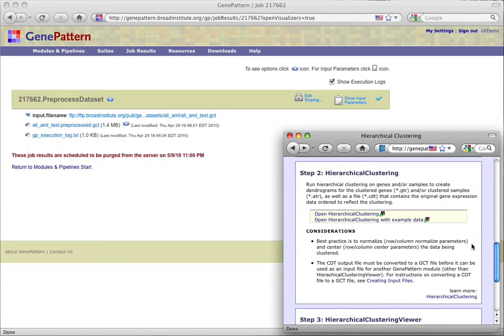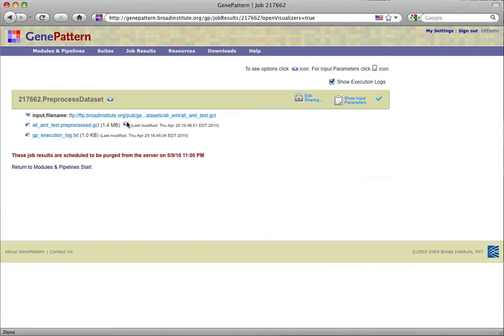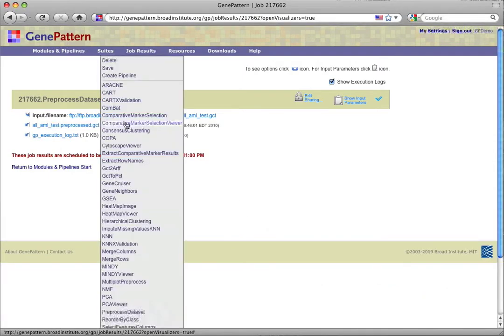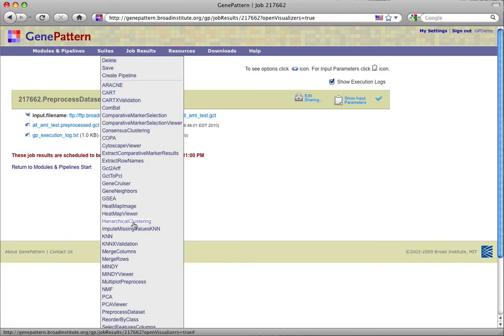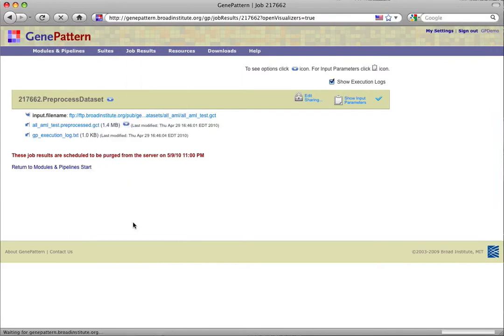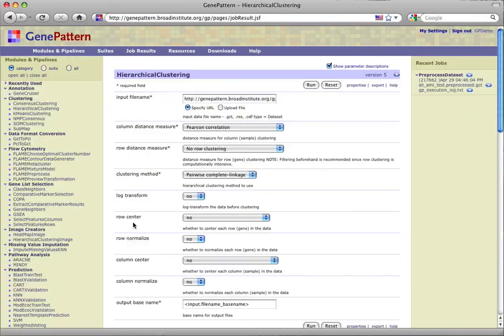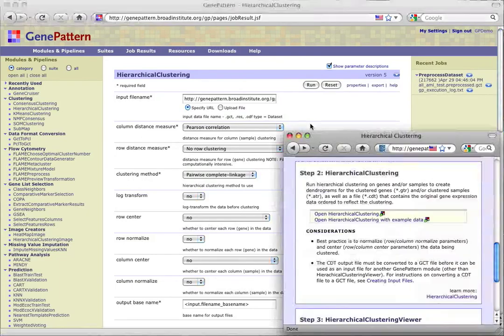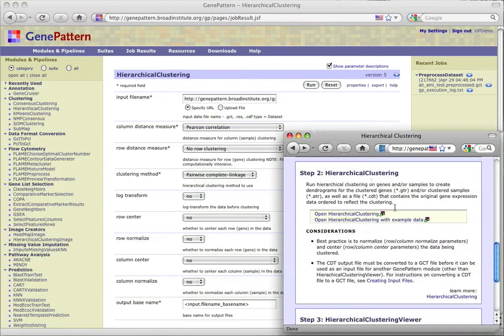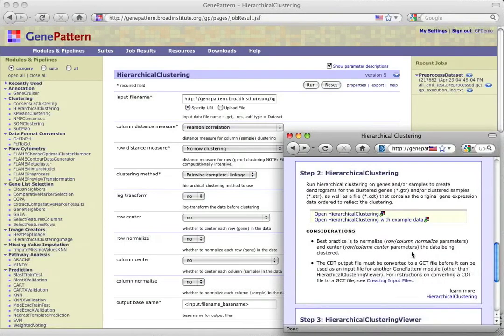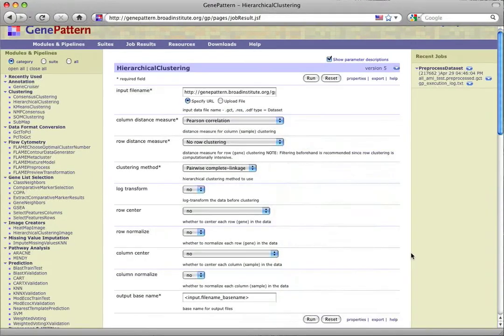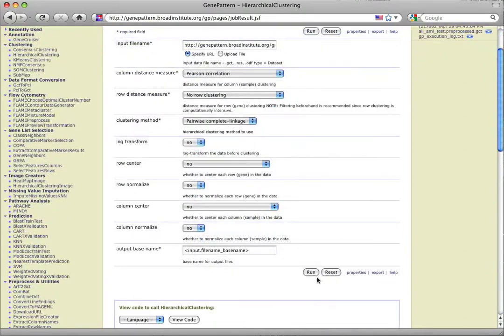Now that our preprocessed data set job has completed, we'll select the arrow next to its output to send it to hierarchical clustering as input, though we could also have chosen either of the options for opening hierarchical clustering from the protocol. Looking at the hierarchical clustering page, we can again check the considerations for this module in the protocol and make any parameter adjustments desired. For this tutorial, we'll leave them at their default values and run the analysis.